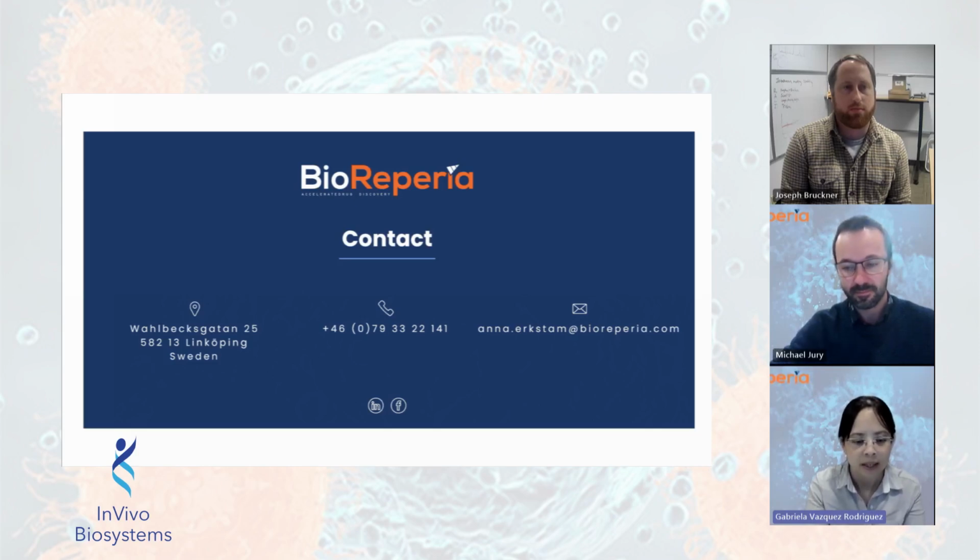So it's just like a container that we use the zebrafish to evaluate response to different treatments, but also, as I was showing in the slides, since it's highly amenable to recapitulate the tumor microenvironment, it can be easily used to study those very early stages of cancer progression and metastasis.